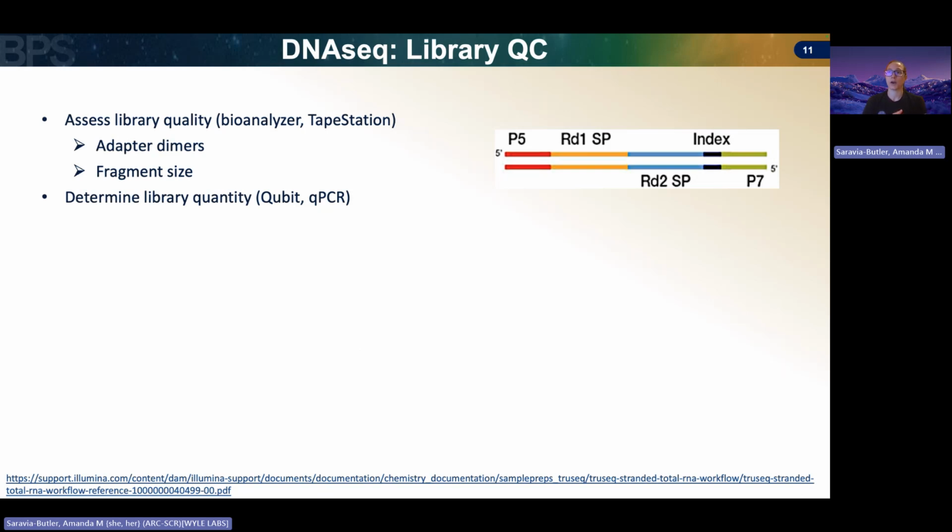We also, with our quality control, want to determine the library quantity, right? So we're going to want to know how much library we have, so that we make sure we load the appropriate amount on our sequencer.